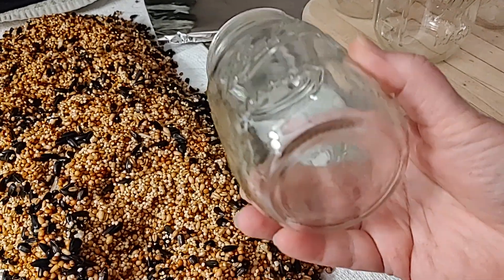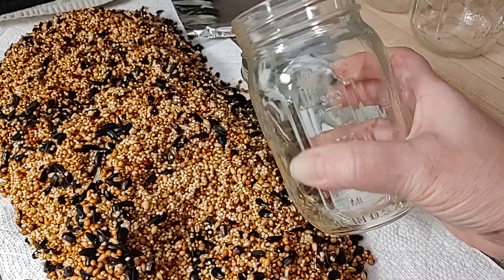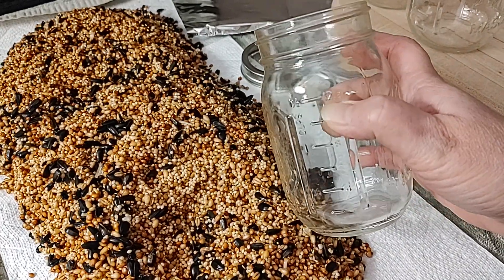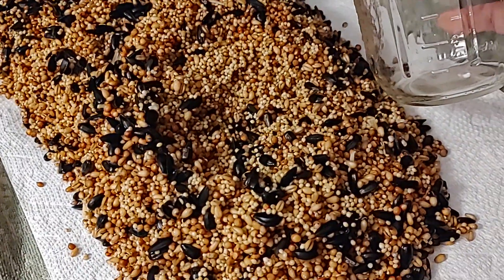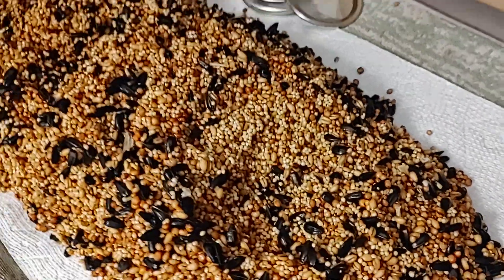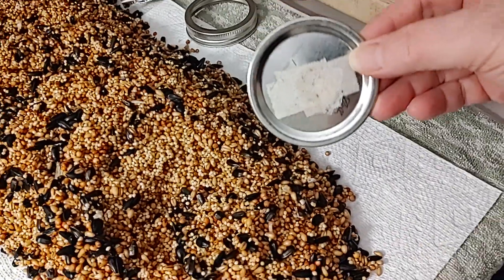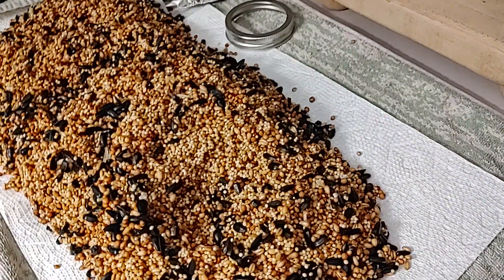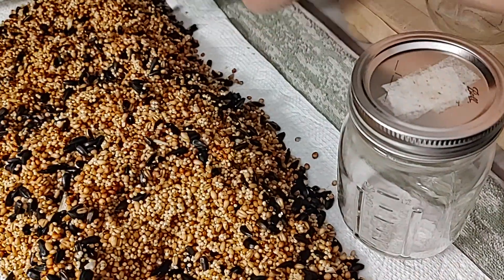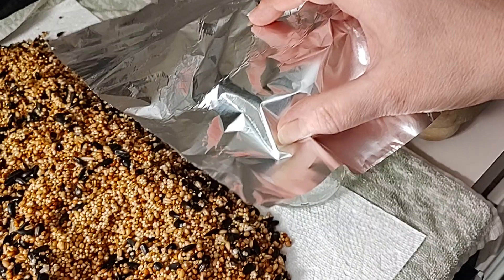We pressure cook these jars in between uses and I'll be filling them to the mark here with this clean birdseed. We did the three-hour soak with three rinses in between, and then we'll be putting these modified lids on top after I fill them, then foil, since they do have a modified lid in the pressure cooker.